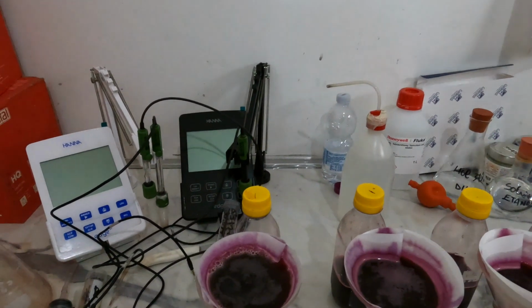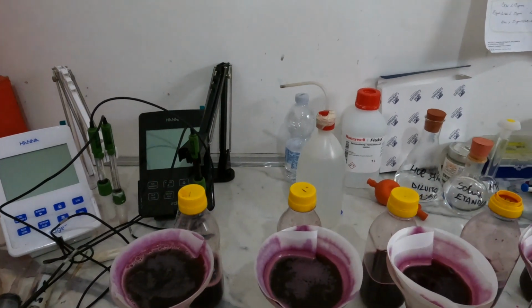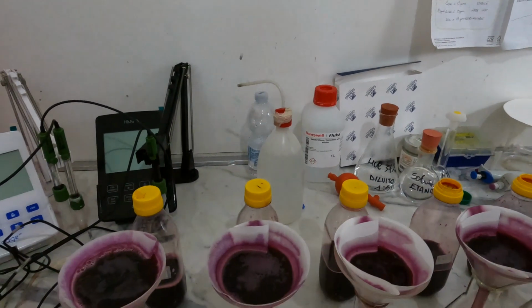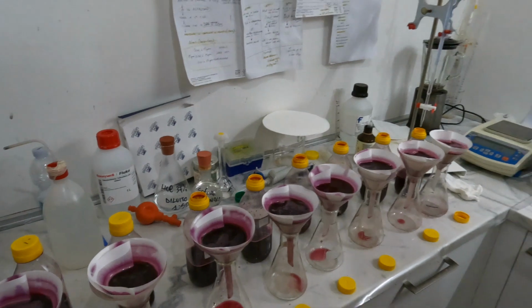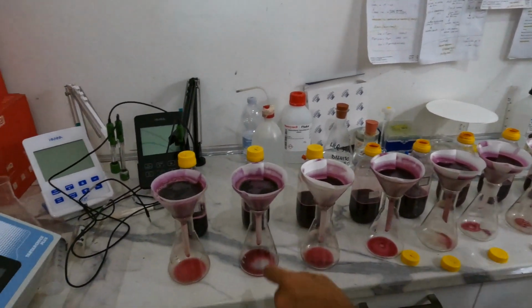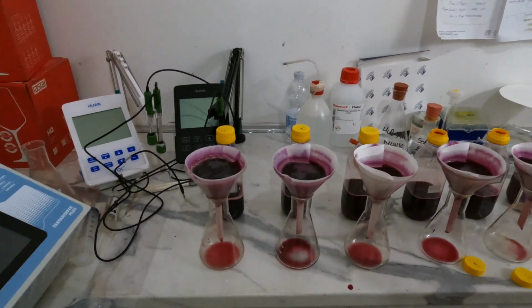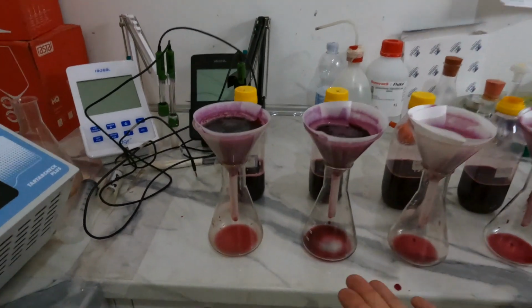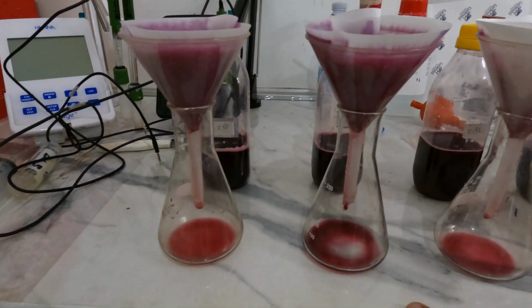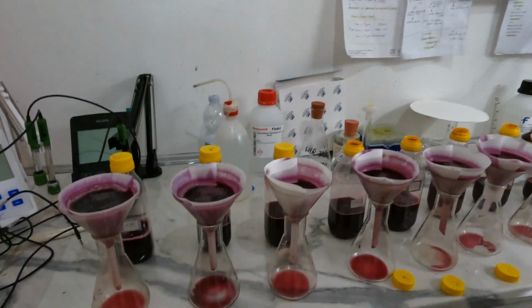Or is it... They are different tanks. Oh, different tanks? Yes. Okay. So how many days has passed? Every tank is at a different step. For example, 68, 78 is the start of fermentation, but 69 is at the end of fermentation.